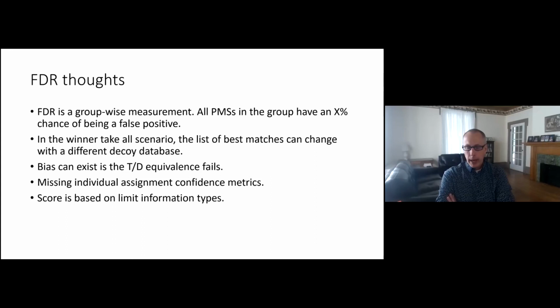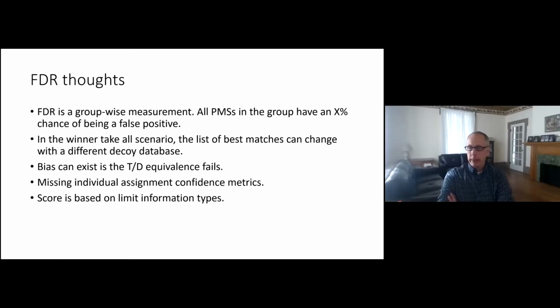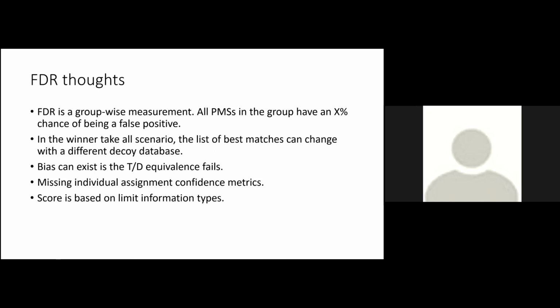No. What we commonly do is when you do a search, you have to provide a target database. We take that target database and reverse all the protein sequences left to right. So basically the order is reversed, and then we assume that no peptide in this reverse database is shared with the target database. So it changes every time, and it's basically the same size as the target. There's no reference decoy databases that are used separate and apart from the target, right? We create it on the fly from the provided database.